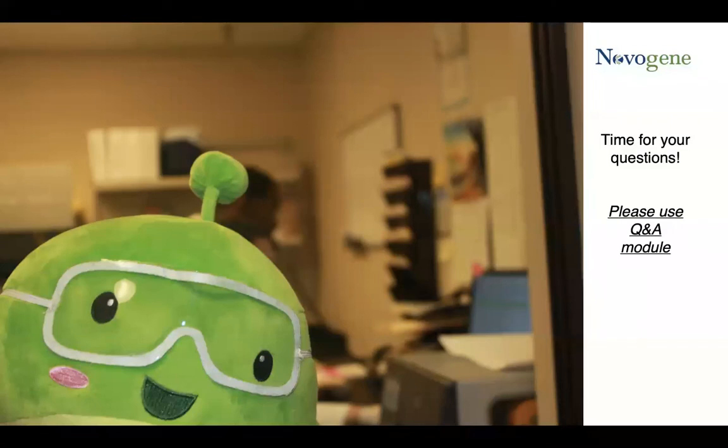Sure. Yes, this is a very good question. Now we have basically two methods for metagenomics analysis. The first one is mapping. The second one is doing it by assembly. Mapping is also called read-based metagenomics analysis, and it basically uses unassembled reads. It was actually one of the first methods to be used, but it is still valuable for quantitative analysis, especially if we want to do research with relevant references and the references are available.